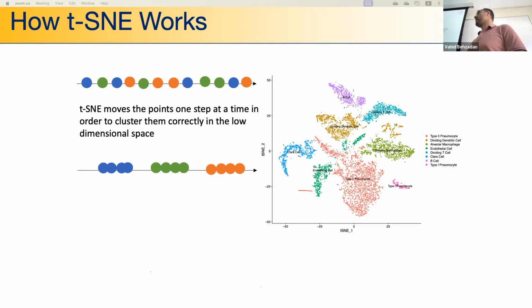So that's not modeling, actually. That's just descriptive analysis, descriptive analysis based on modeling assumptions. I still call that modeling. Okay. One of the modeling assumptions that you made here was a steady state description.